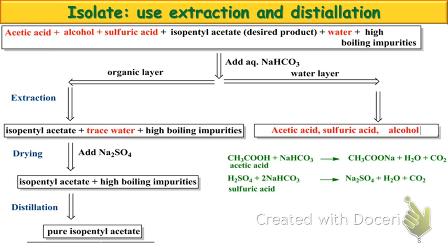Okay? So what's going to happen? You're going to see two layers. You're going to remove the water layer. Now it's gone. Okay? And that's where we've got what's occurring on the left over here. Or that's my right. Let's try that again. Okay? We're just pipetting that away.